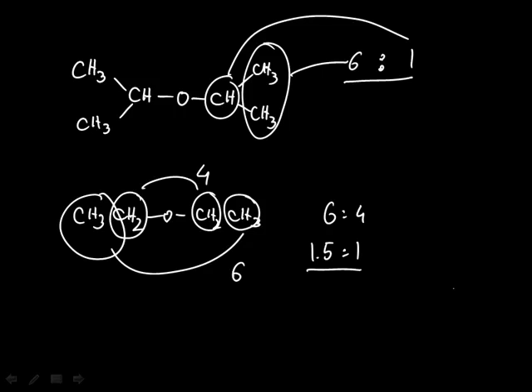In the next subtopic, we'll present the last and the most complex piece of evidence that NMR provides us, that is peak splitting.